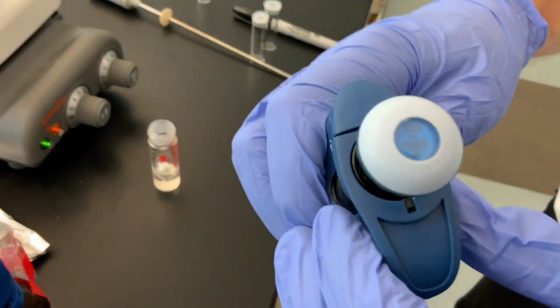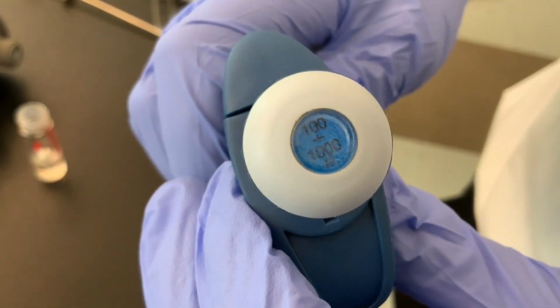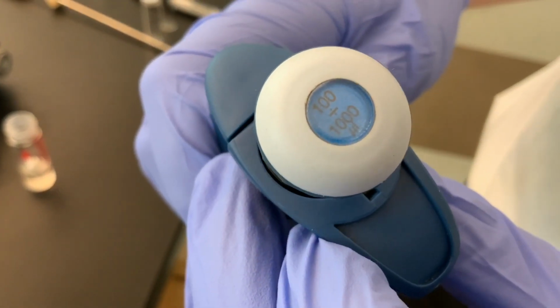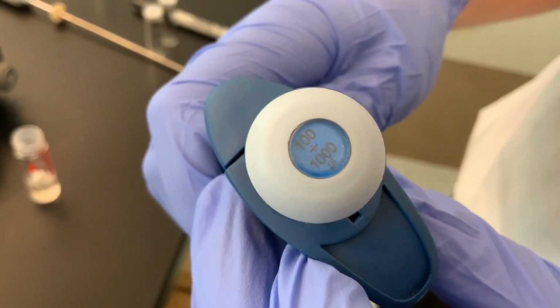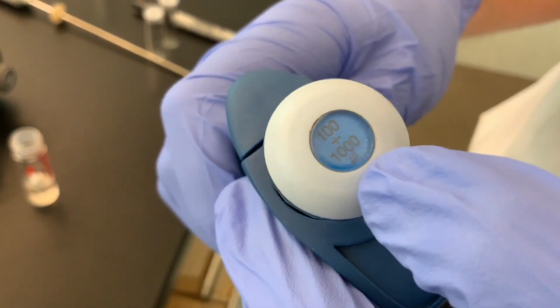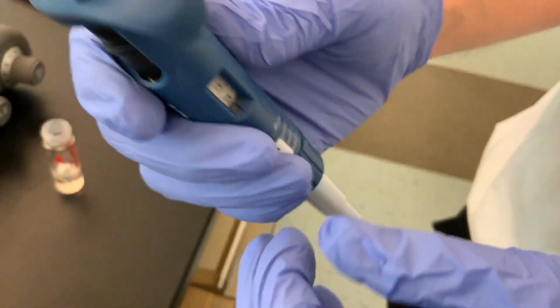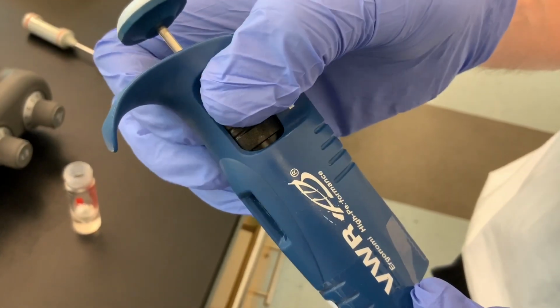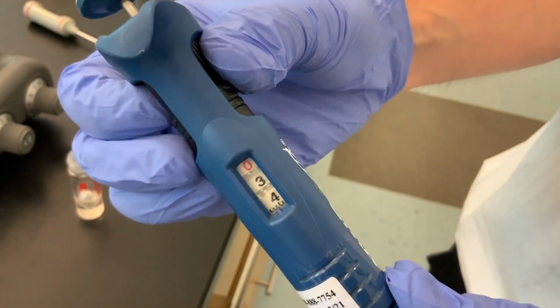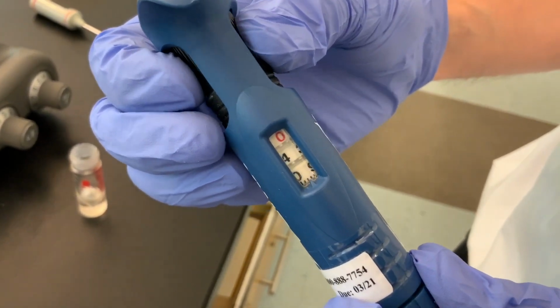So you check on the depressor here, and it goes from 100 to 1,000 microliters. So 1,000 microliters is 1 milliliter. So that's the maximum of this automatic pipette. And then how to change that is you look at the side, and here's a dial right over here on how to change the volume that the automatic pipette will draw up.